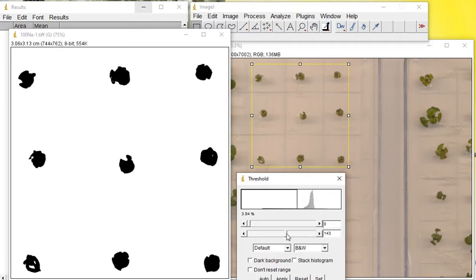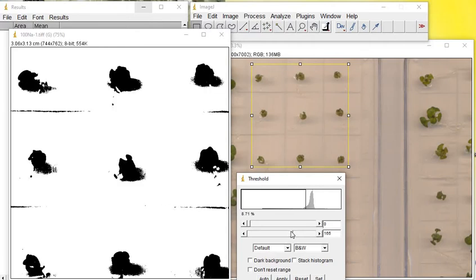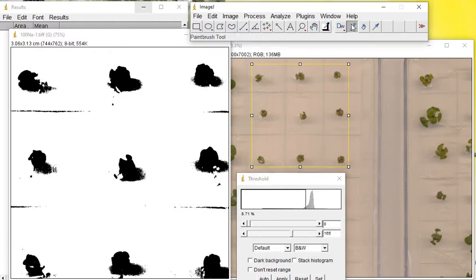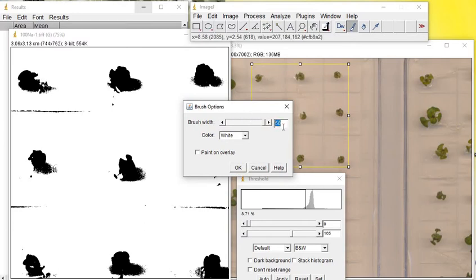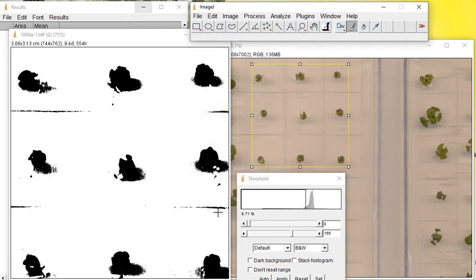One thing you can use is this eraser or the brush option. From this one, you can change the size of this brush, like 30, then if I click OK, you can erase these particles.